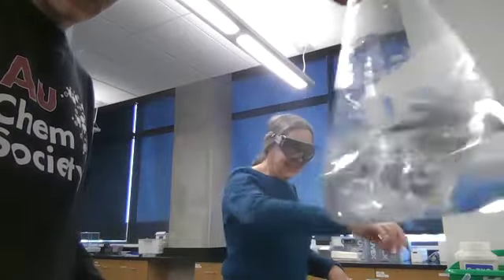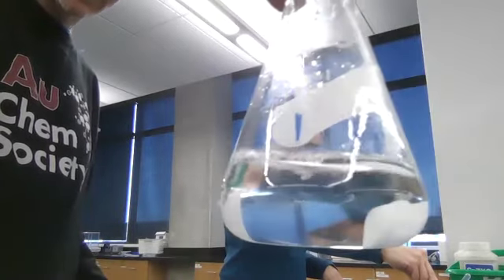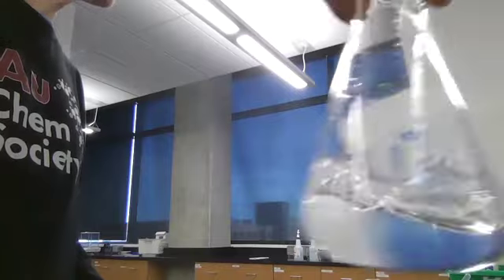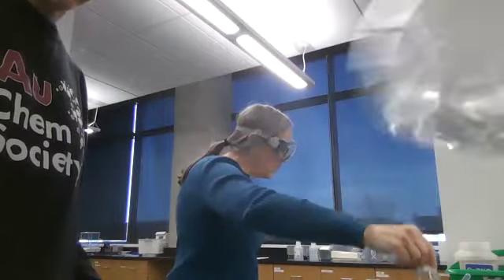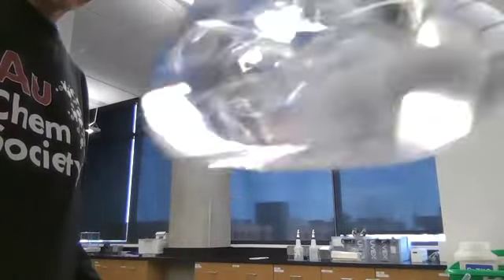Hopefully I don't spill anything on the keyboard. Still quite clear, eh? Yes. If I remember right, this one takes what, 2 minutes? Yes. So things to do while you're waiting. Are we working on flask 2 of trial 2? Yeah, I'll get these right. I won't make the same mistake a second time. Trying to hold this in front of the camera.